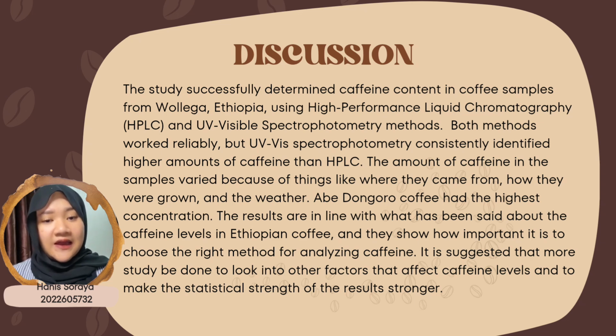The results are in line with what has been said about caffeine level in Ethiopian coffee, and they show how important it is to choose the right method for analyzing caffeine. It is suggested that more study be done to look into other factors that affect caffeine level and to make the statistical strength of the results stronger.